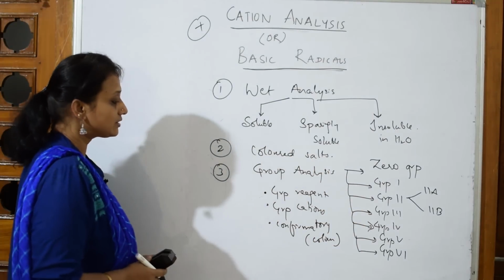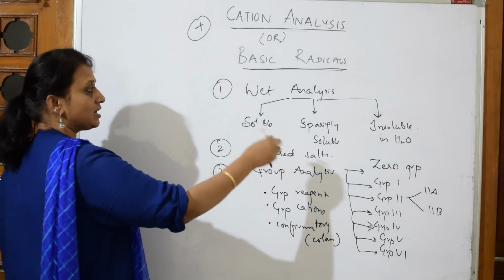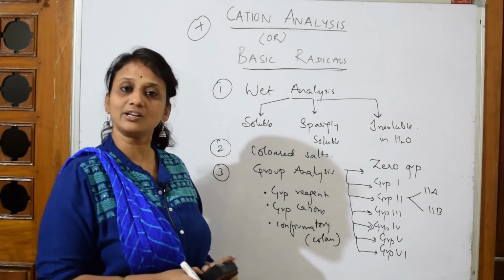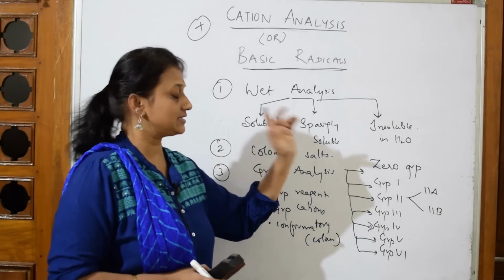After doing this, as I told you, I'll be starting with one after the other. First, please take your notebook, start writing, put the heading cation analysis, and let's start off with these three.